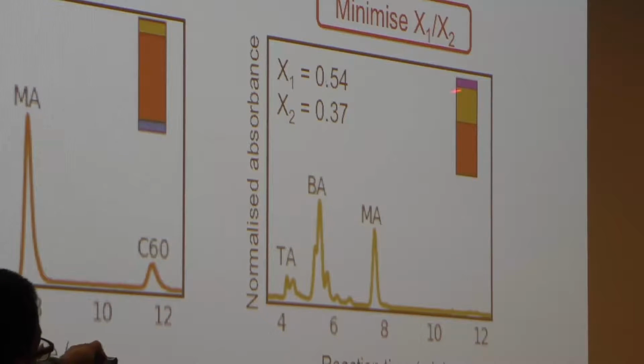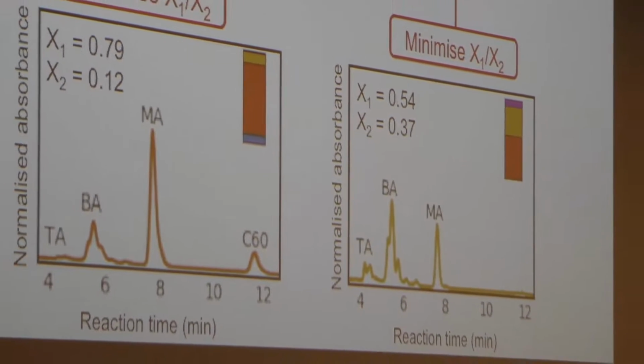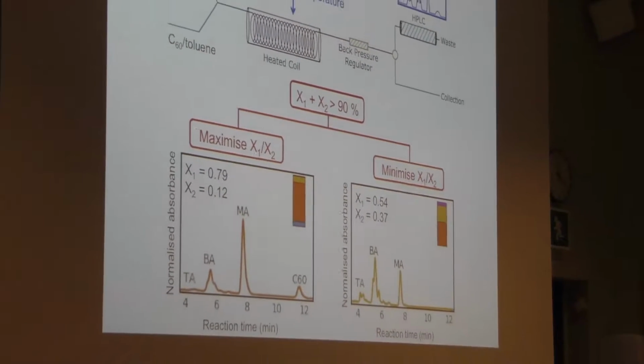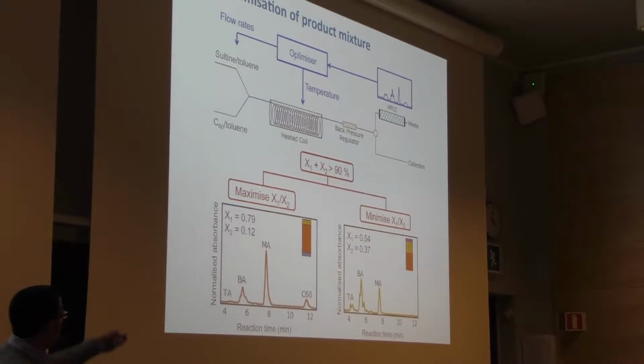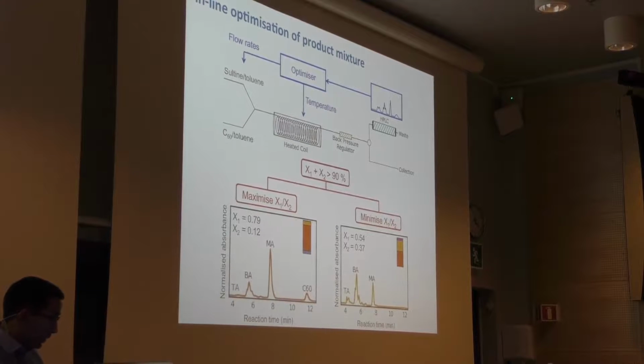But we've achieved that now by producing a small amount of the third order derivative. So we're still restricted by the kinetics of the reaction, but we've squeezed the optimum we can out of the system just by allowing the algorithm to satisfy the criteria explained above.